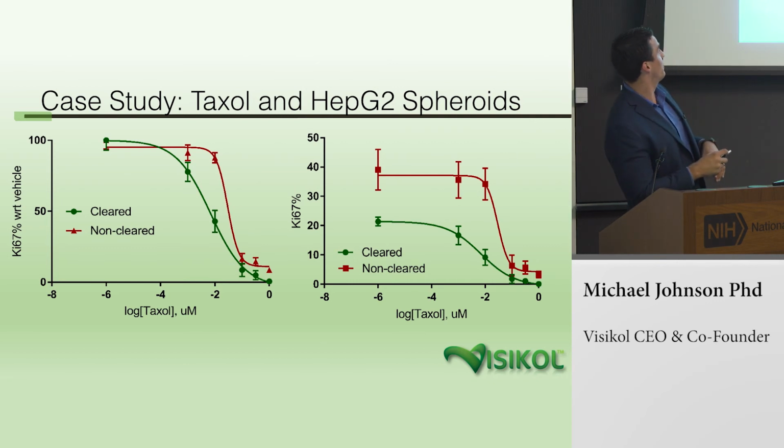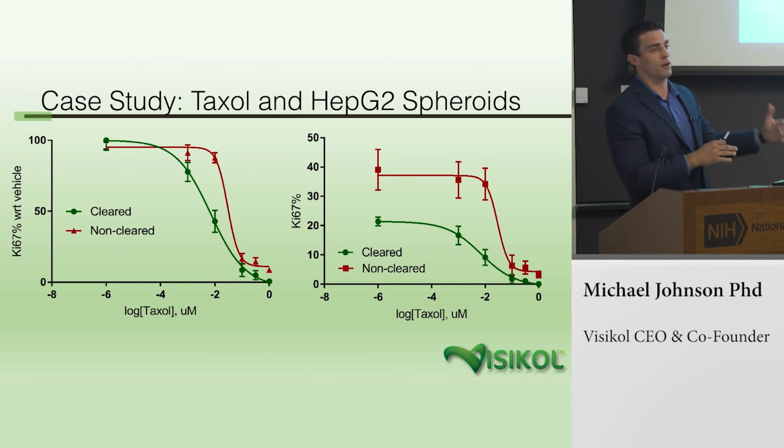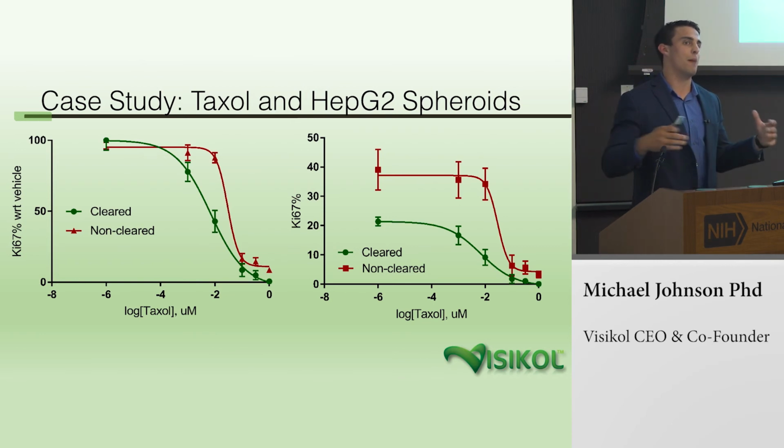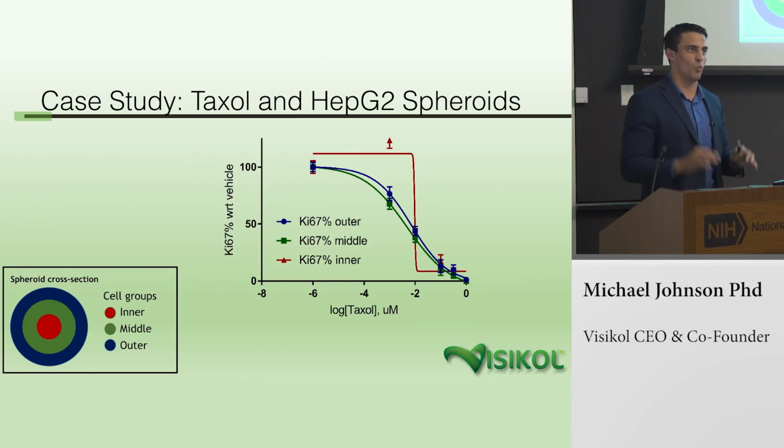And if we look at it with respect to the vehicle over here, that difference is very significant. And we get very much higher sensitivities based upon clearing versus not clearing, as we're increasing that population of cells by about 3 to 4-fold, and we're actually characterizing that entire population. So getting at, again, why this is important and why 3D data.